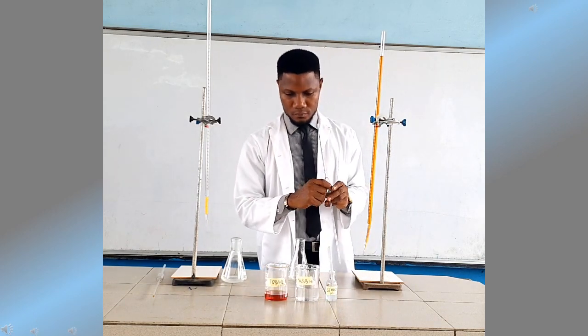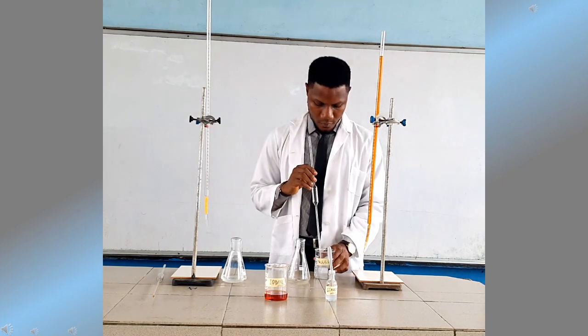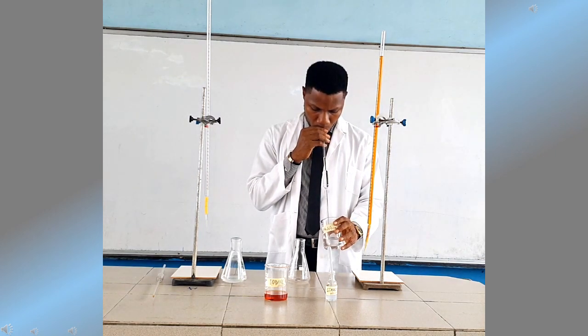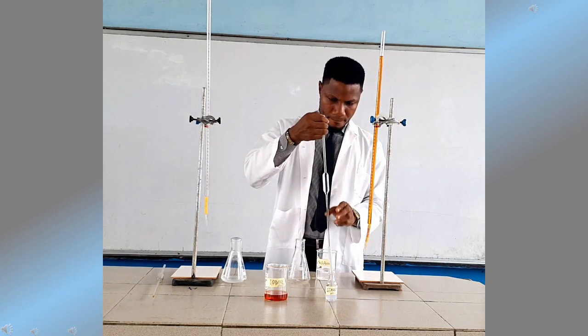So, what goes into the conical flask is the sodium thiosulphate. So the sodium thiosulphate is sucked with the pipette and transferred into the conical flask, just as we're doing right now.